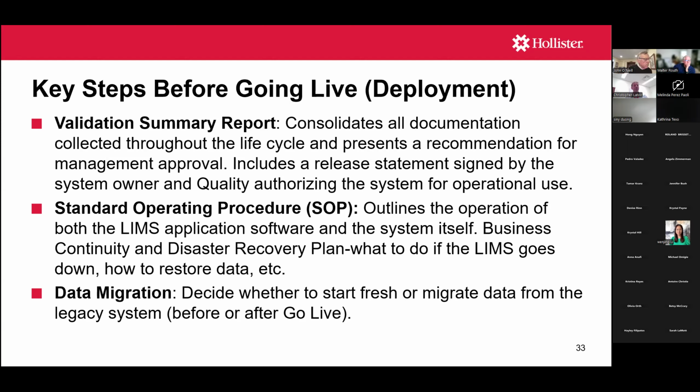You need to have SOPs in place, however, before you go live, outlining operations of the different functionality of your LIMS software and the system itself. One thing to consider is also some type of business continuity or disaster recovery plan.